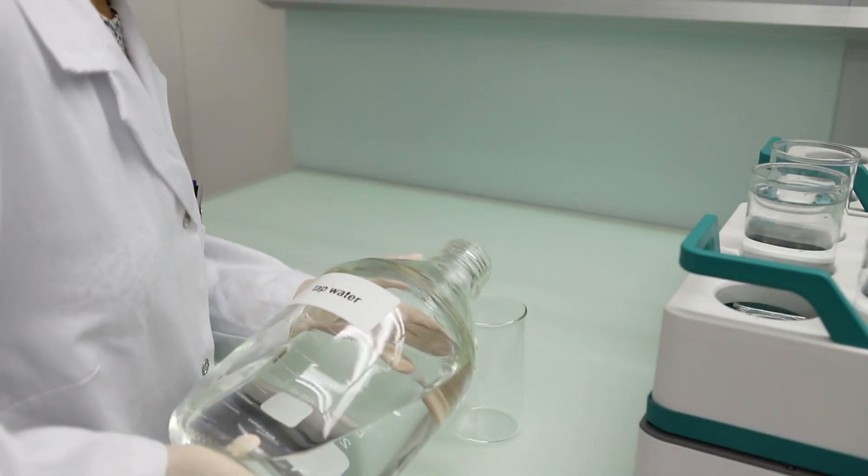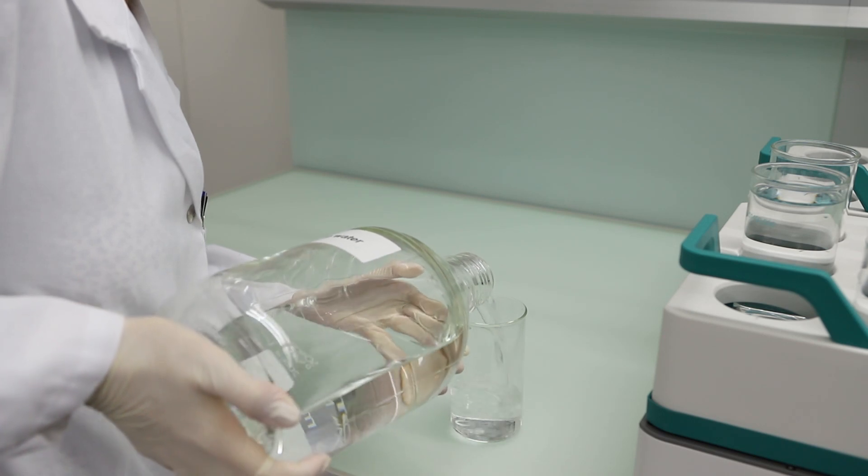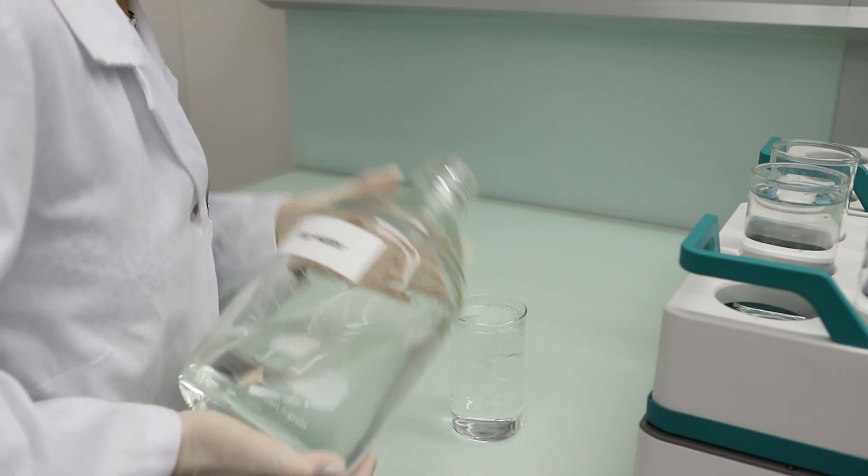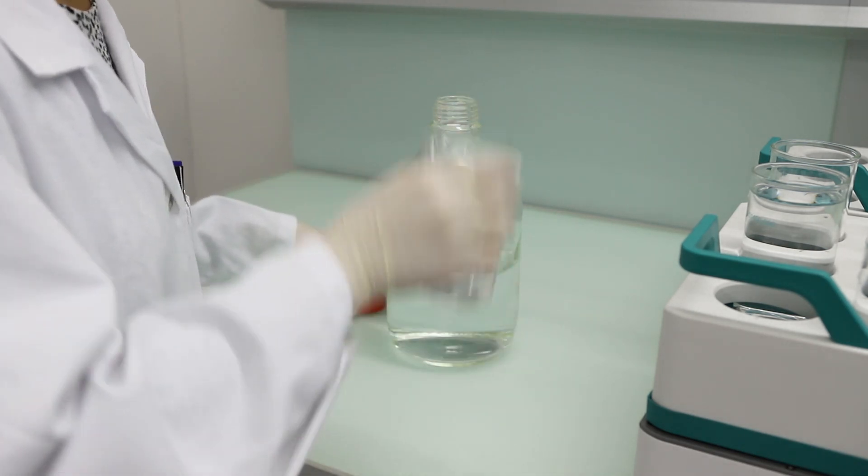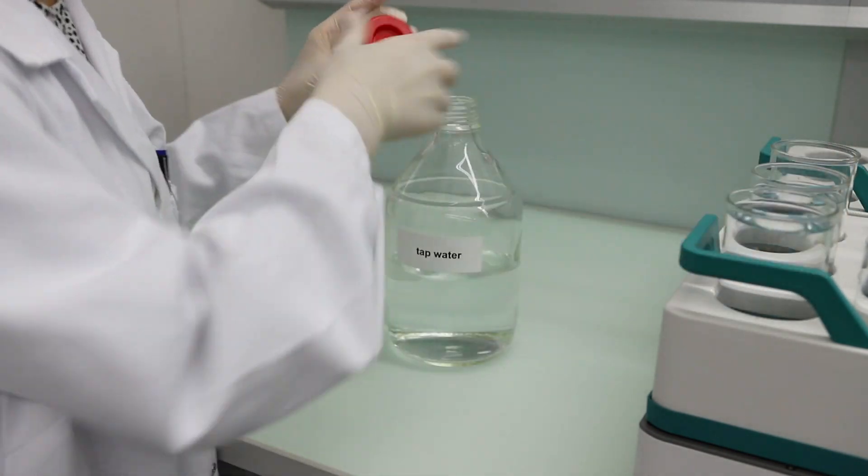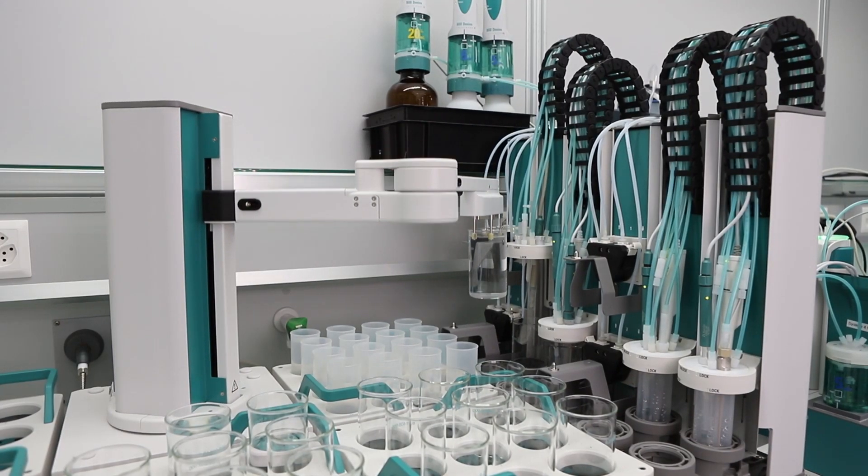250 ml beakers containing sample are placed on the rack. All parameters are measured out of one sample beaker. Besides the sample beaker handling, the complete liquid handling is fully automated.